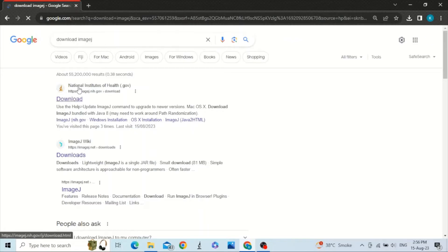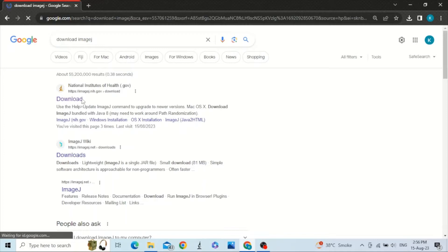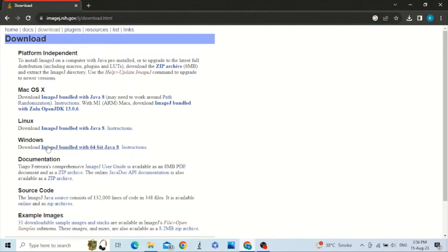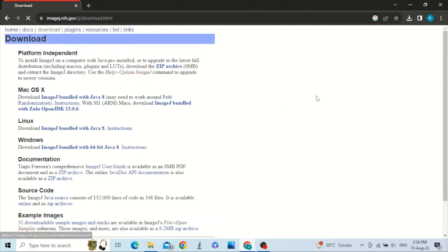This will take you to the National Institutes of Health website. Just go to downloads. You have different platforms like Mac, Linux, and Windows. I have Windows platform, so I will click it to download it.